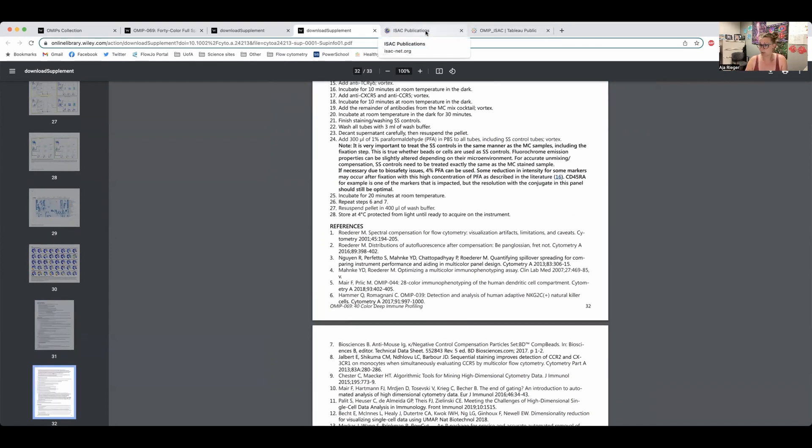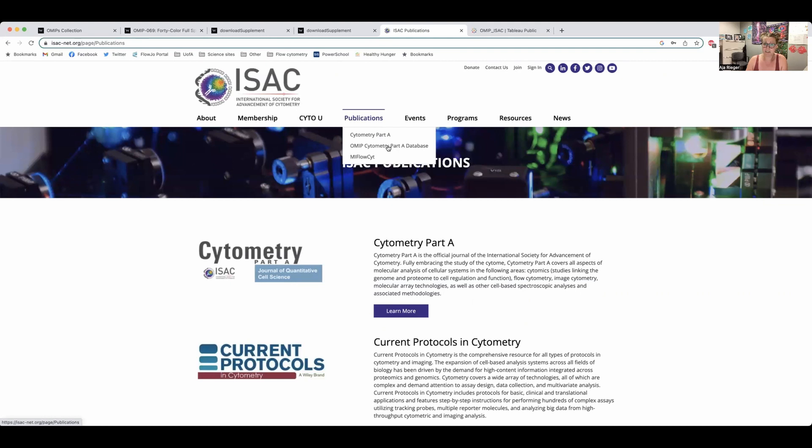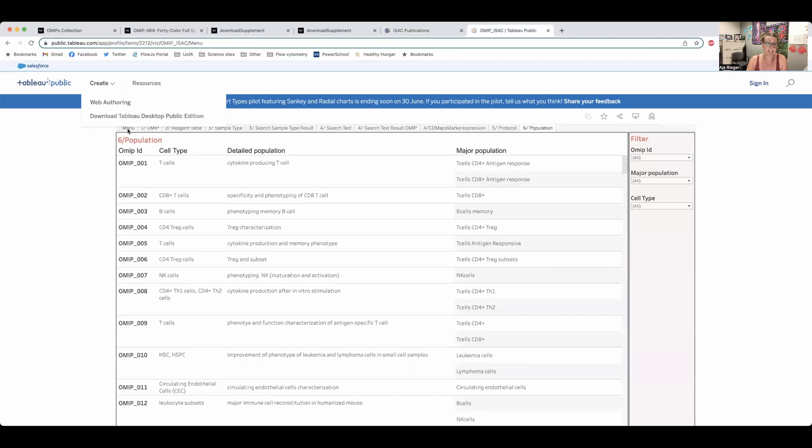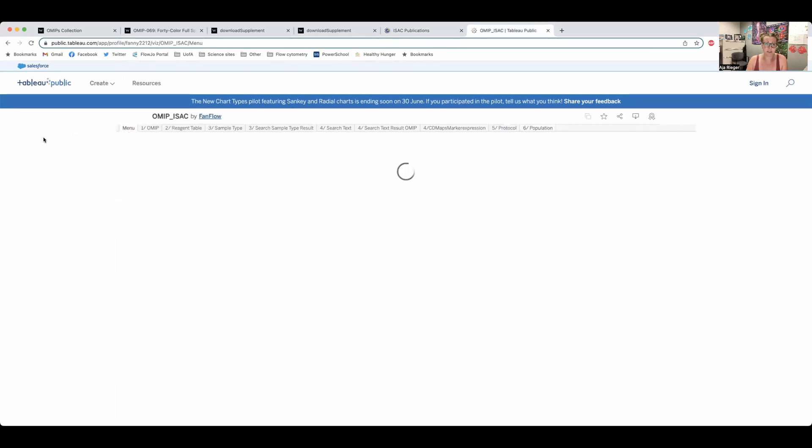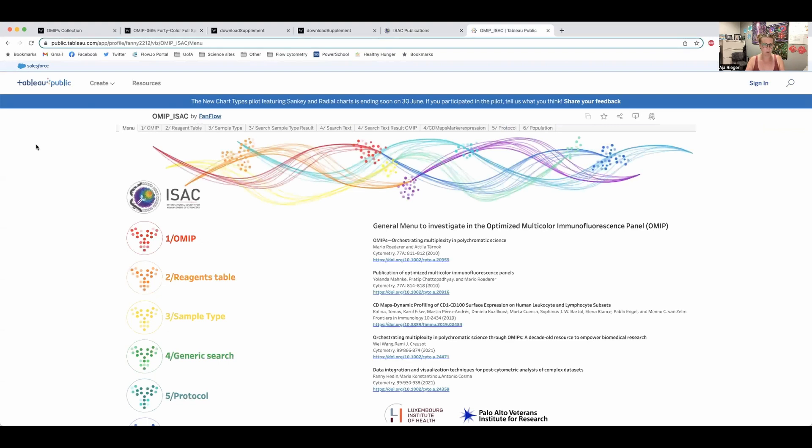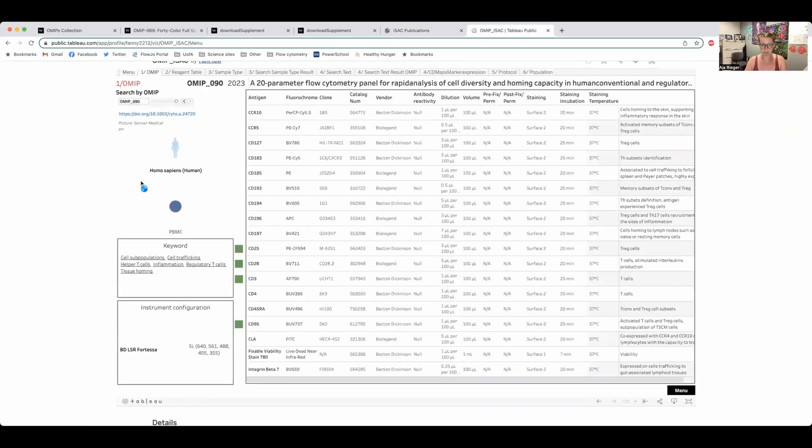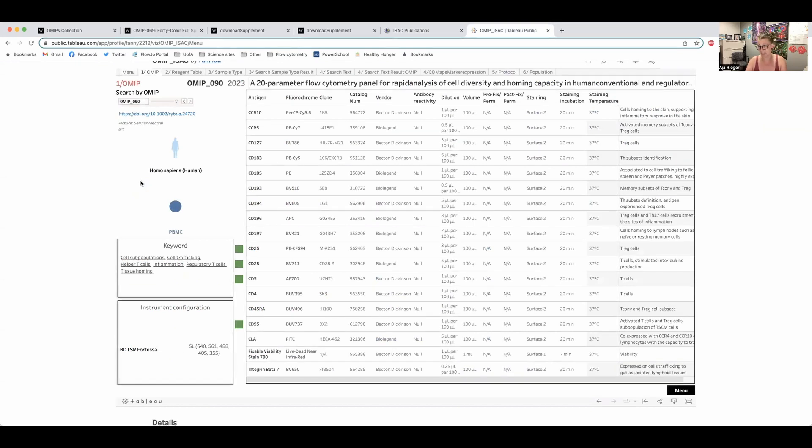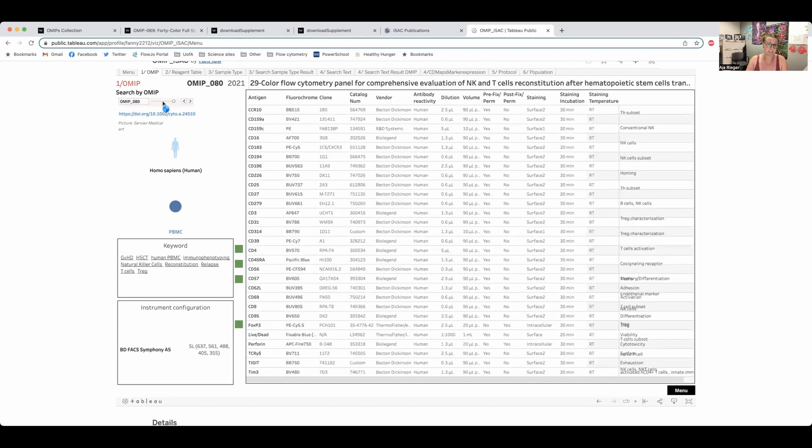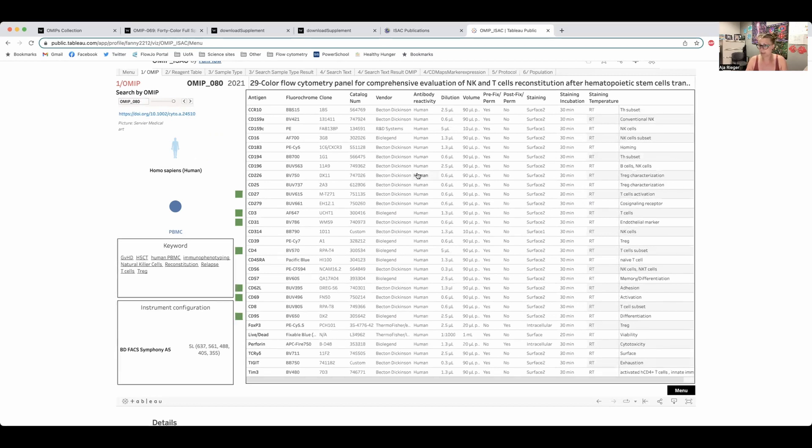So there is a group that's put together a really great OMIP resource that can be found on the ISAC website. So ISAC is the International Society for the Advancement of Cytometry and under their publications you can link to the OMIP Cytometry Part A database which takes you to this. And it is an in-depth way of looking through OMIPs to more easily find what you want to find. So we'll go through each one one by one. If you want to search a specific OMIP and you know which one that is, you can do that here. That's what this first page is for. So if we want to look at OMIP 80, it will automatically update and show us OMIP 80 here. So if you want a really quick resource and you know which OMIP you're looking for, that's what the first tab is for.